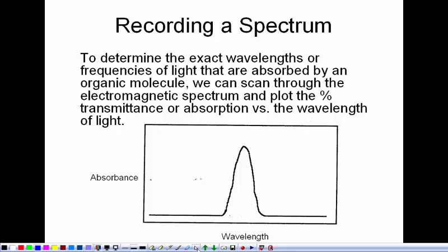And depending upon the technique, the peak may be really narrow or it may be really broad. It depends. In general chemistry, what you did was you passed a particular wavelength of light through the sample, and then you had the wavelength, you measured the absorbance, and you plotted absorbance versus concentration and got a straight line and used it quantitatively.